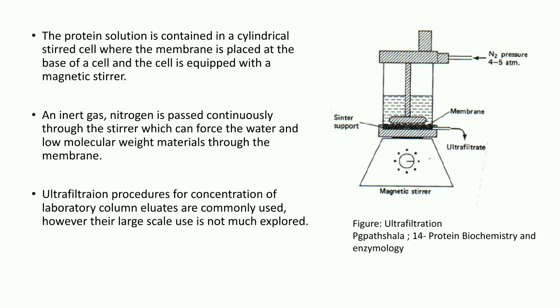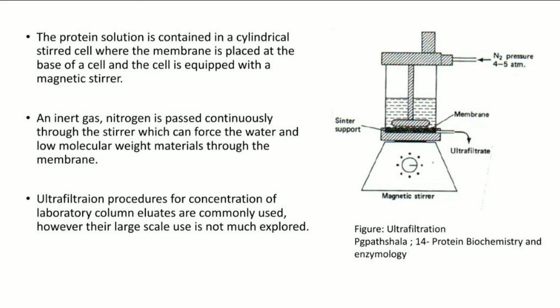Ultrafiltration procedures for concentration of laboratory column eluates are commonly used. However, their large-scale use is not much explored, but they are very popular for concentration of solutions.